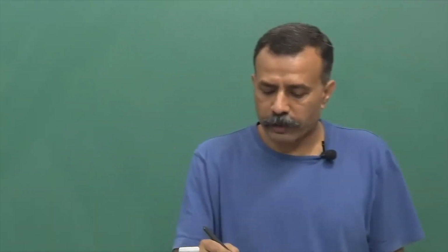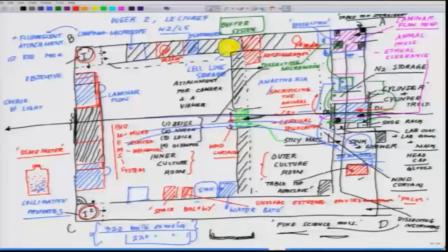There is another buzzword in the market which is called lab on a chip, which is nothing but a small setup where you are growing the cells, which is self-contained, so you have a supply of medium and everything within it. We'll come to it later. At this point, just listen to me and think over it, but we'll come systematically to this topic.